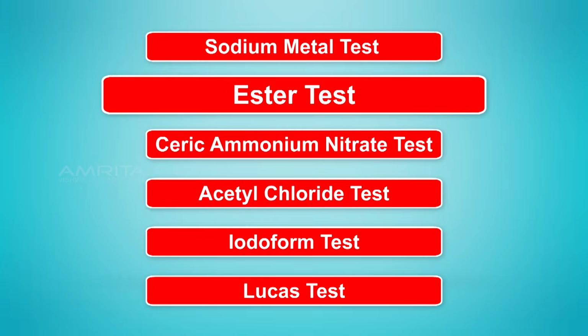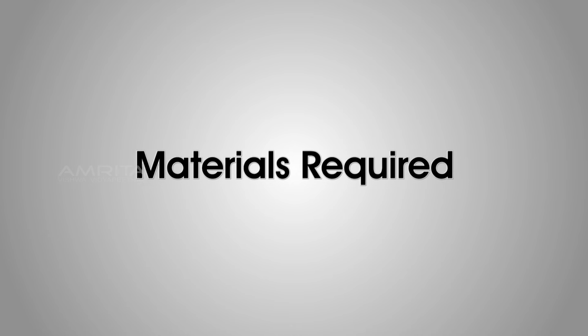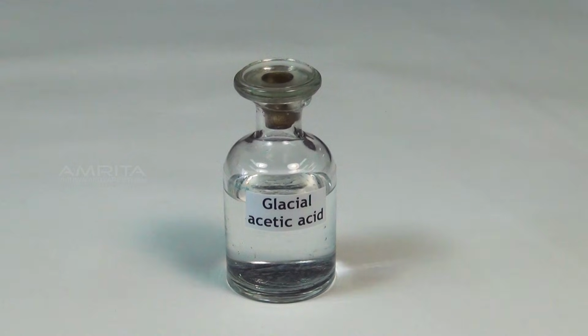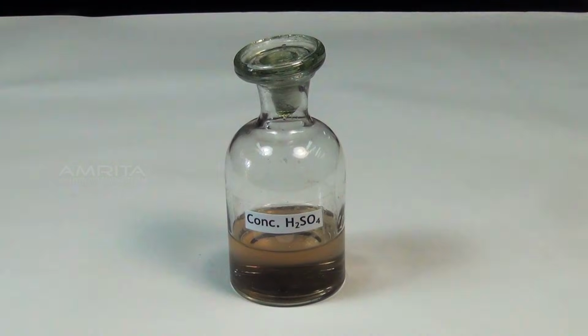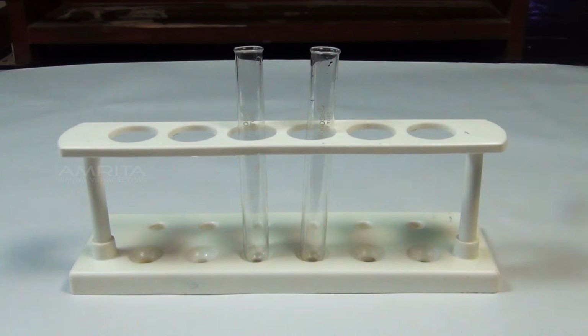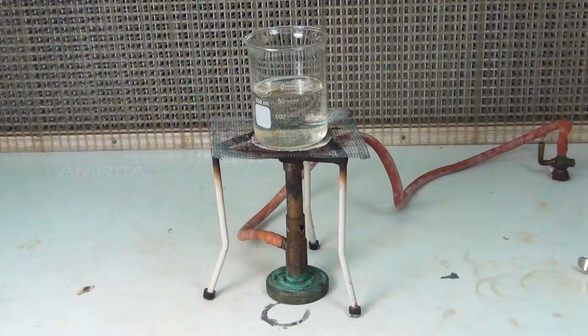Ester test. Materials required: organic compound, glacial acetic acid, concentrated sulfuric acid, cold water, test tube, droppers and water bath.